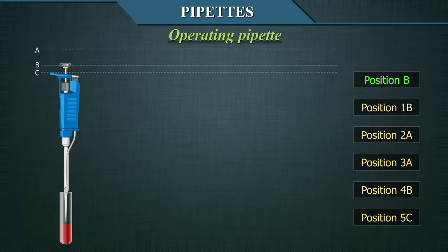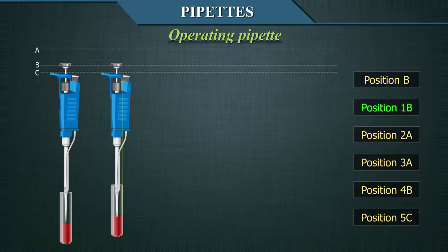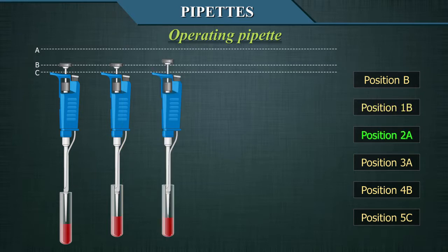To aspirate, press the plunger gently until it reaches position B, the first limit. Until this point, the tip of the pipette must not touch the liquid. Put the extremity of the tip into the liquid and verify the recommended depth or follow the manufacturer's recommendation. Confirm that the pipette is in a vertical position. Then release the plunger gently for the pipette to aspirate the liquid, verifying that the plunger is completely released. Wait at least 2 seconds before removing the pipette's tip from the liquid.